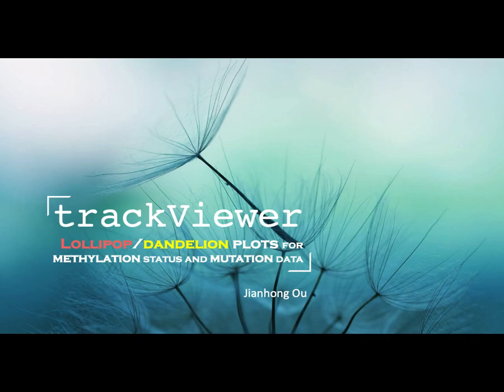Hello, I'm Jianhong. Today I will introduce TrackViewer, a tool to do Lollipop and Dandelion plots for methylation and mutation data.